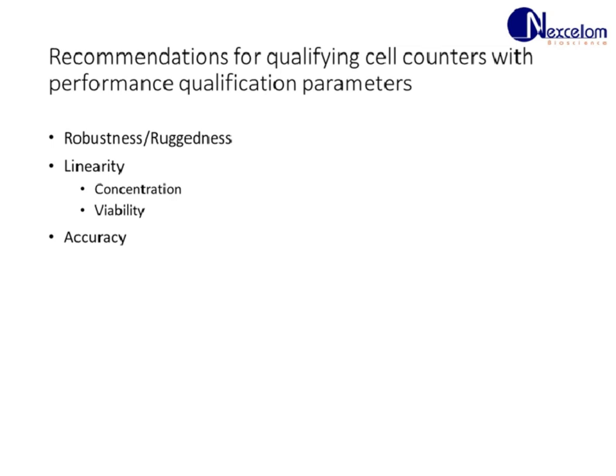Finally, you can look at accuracy with these types of cell counting method, which comes from the standard deviation when looking at the linearity method for identifying what is the range that would be best for the cell counting method. And again, range also falls into the linearity experiment.